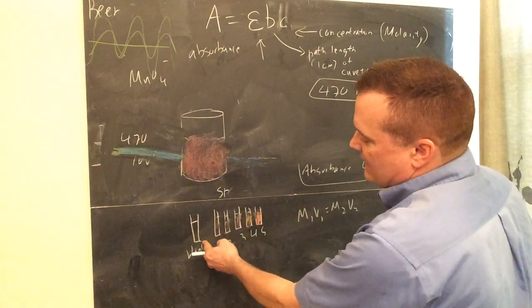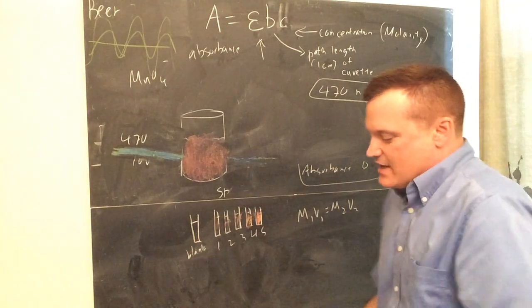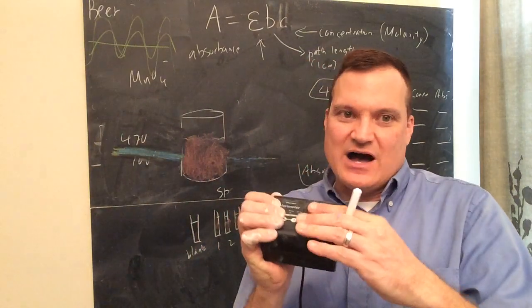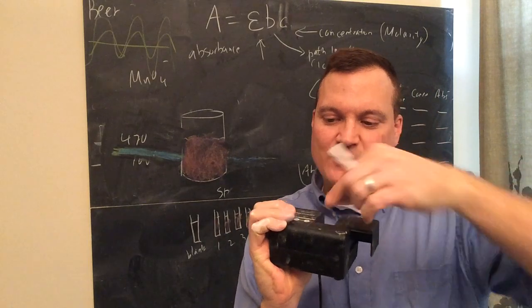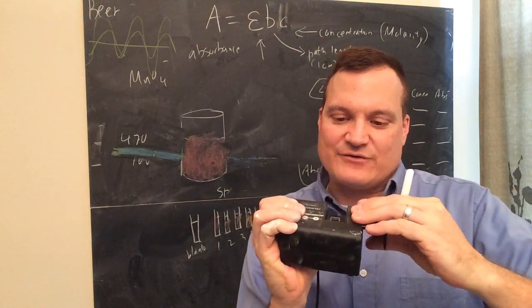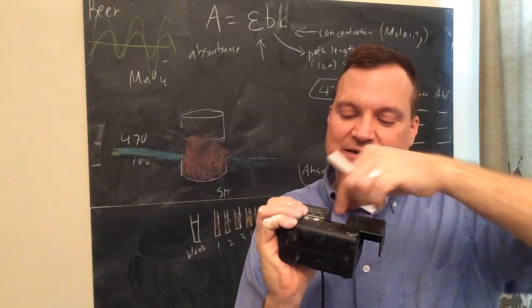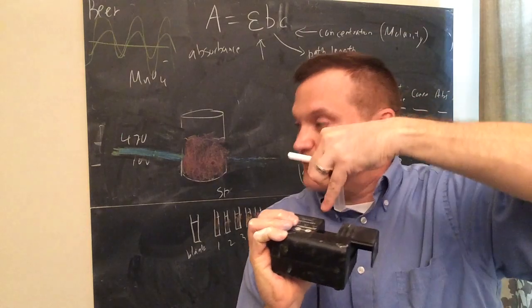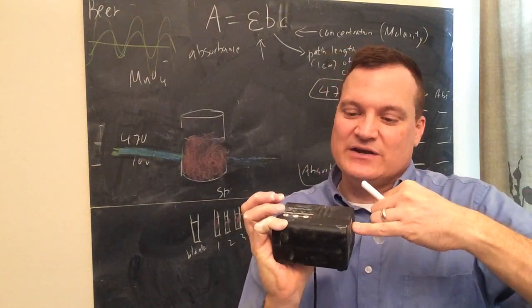Then put in the blank, calibrate, number 2. The blank, calibrate, number 3, and so forth. And every time you do it, you open this up. You put the cuvette inside, the blank one, for example, and calibrate. After you get the value right, you write down the value. Well, you don't write down anything from blanking it. Then you take this out. Now you put in the red one. Then you close it and don't push calibrate, and just read what the number is.